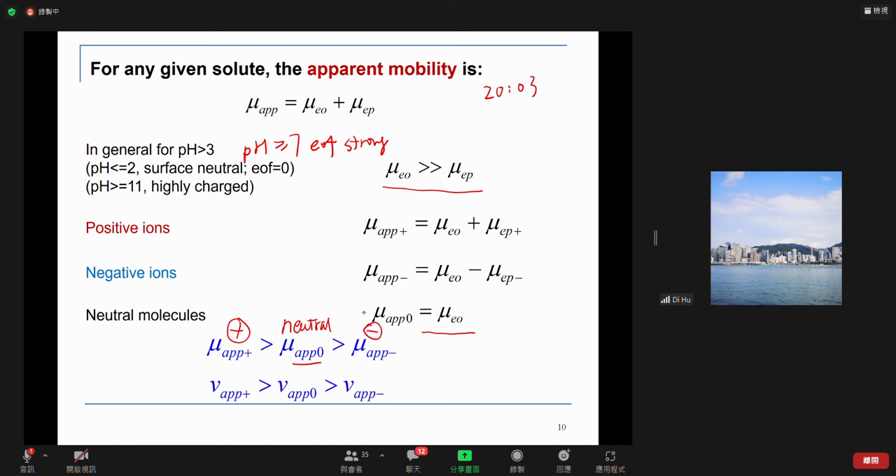Under the most simple capillary electrophoresis, which we call capillary zone electrophoresis, we expect the cations to come first, then the neutral compounds, which cannot be separated from each other, in the middle as one peak, followed by the anions. For cations, they elute in reverse order compared with what we see in IC, and for anions we see exactly the same order.